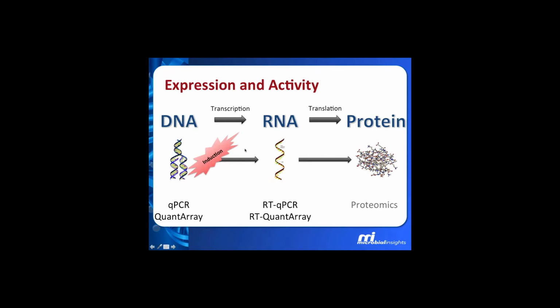Eventually, we'd like to get to the end where we can do proteomics on a commercial basis and be able to look at that and translate that to activity at a site. But for now, when we look at the RNA, that gets us a step closer to where we want to be, and we can get a lot of information that I think Kerry's going to show you the value of, looking at the RNA, especially when it comes to petroleum hydrocarbons or organisms that are more ubiquitous in the environment.